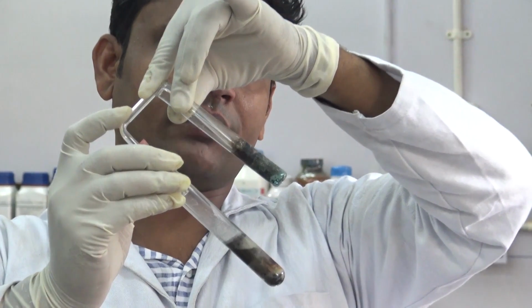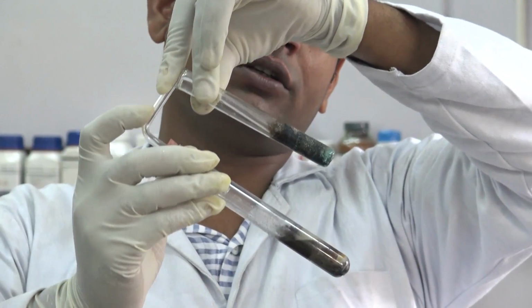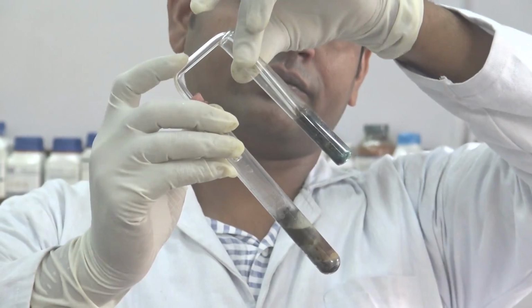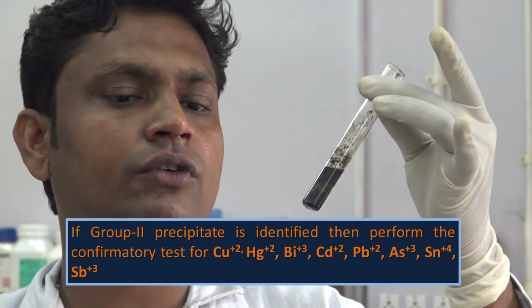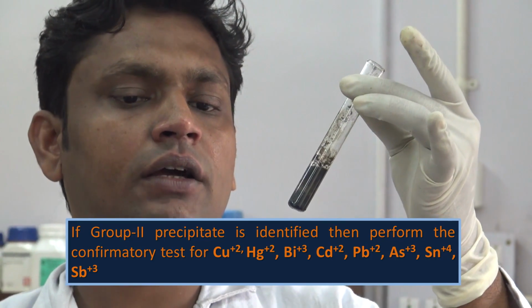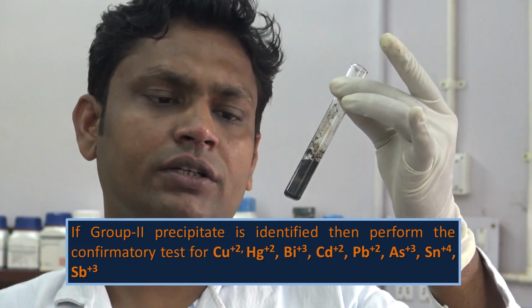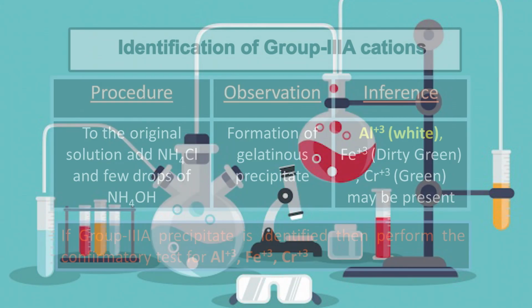Here you can see that a black precipitate appears after passing the H2S through the acidic salt solution. If after passing H2S in acidic solution this type of black precipitate appears, then we have to test for copper, mercuric ion, bismuth, cadmium, lead, arsenic, tin and antimony cations. These belong to the group 2 cations.